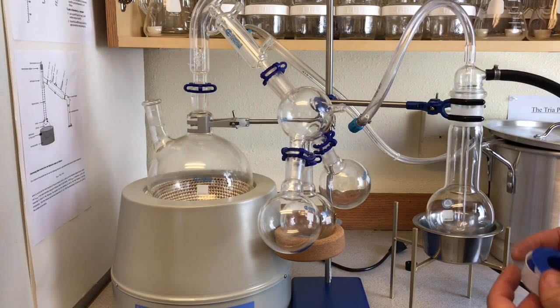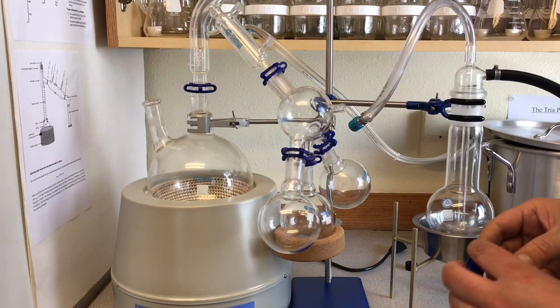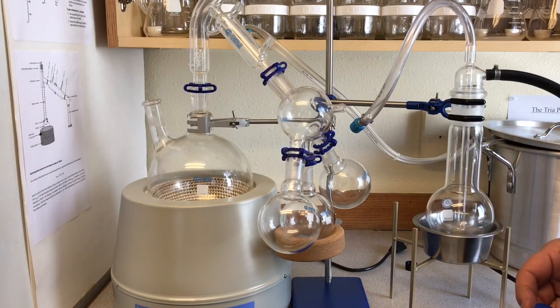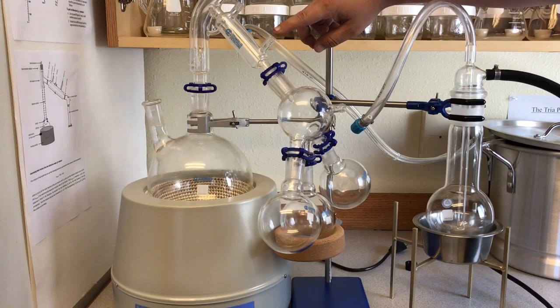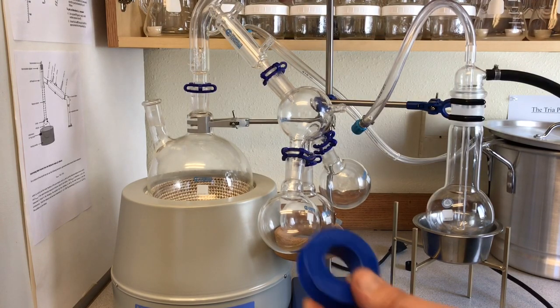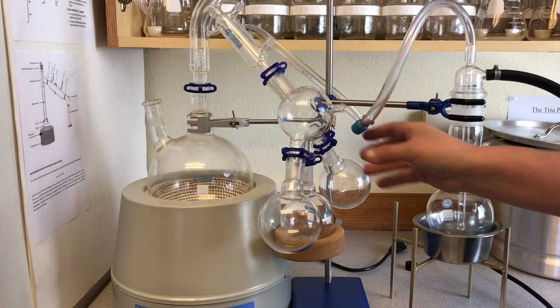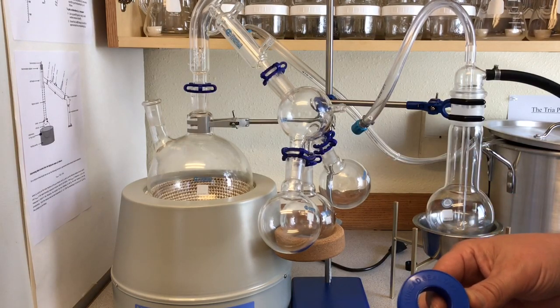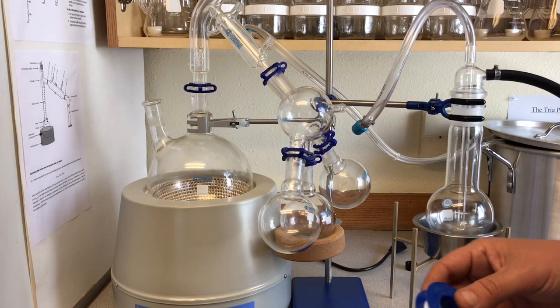And then we'll be able to connect our vacuum line here. I like to use a little bit of Teflon tape on the connections. Not so much on the water connections that come in and out here. The cold water is going to come in here and come out here. But at the very top here, we're going to put a thermometer, and I like to use a little bit of Teflon tape on those threads. And right here, this is a vacuum connection, and I like to use a little bit of Teflon tape. The reason why is because we don't want any of our joints to be leaking. We want to get as strong of a pressure as we can from our vacuum pump.